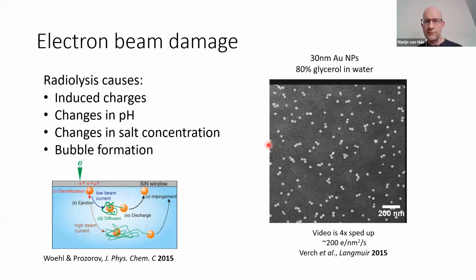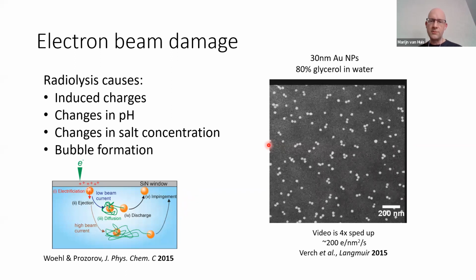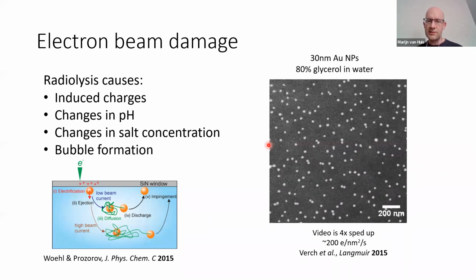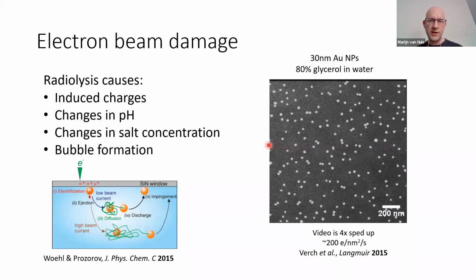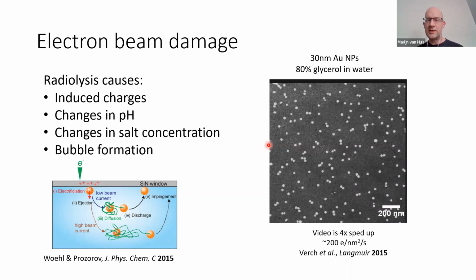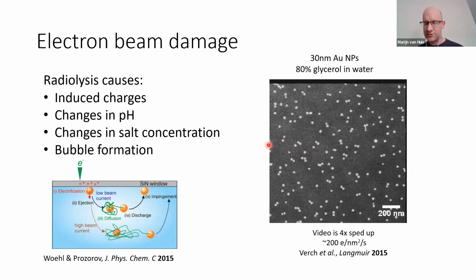So there have been several reports on movements of nanoparticles. But if you would calculate what the real diffusion should be, like in 3D in liquid, then you would expect things that are many orders of magnitude higher. So very often the reported diffusivity, so the self-diffusivity, let's say the Brownian motion, is 5 to 8 orders of magnitude off. It's really enormous.